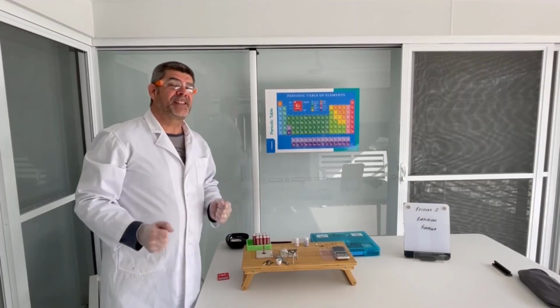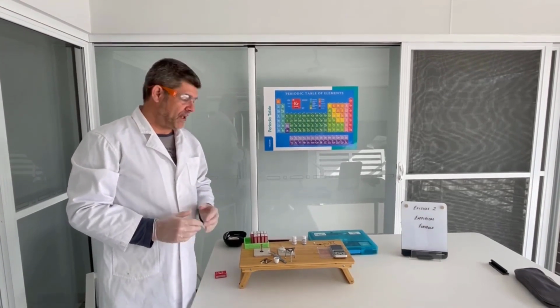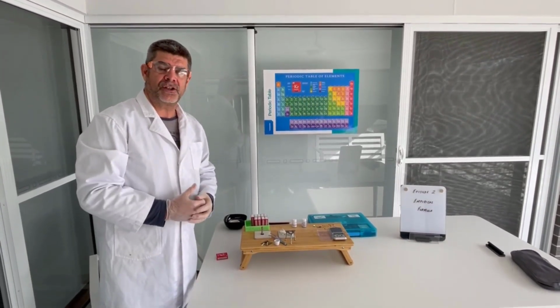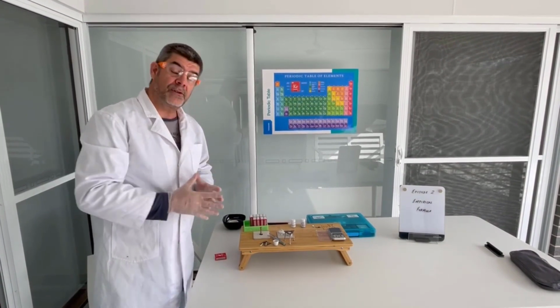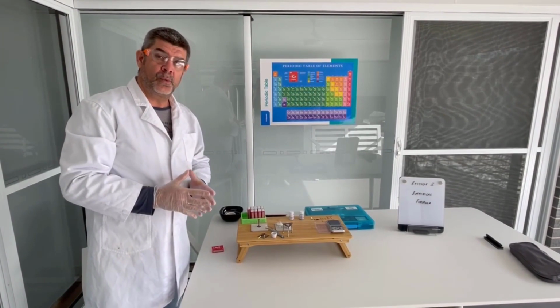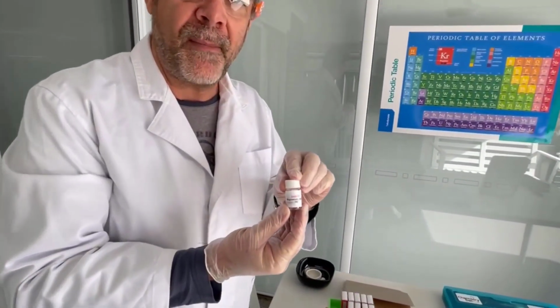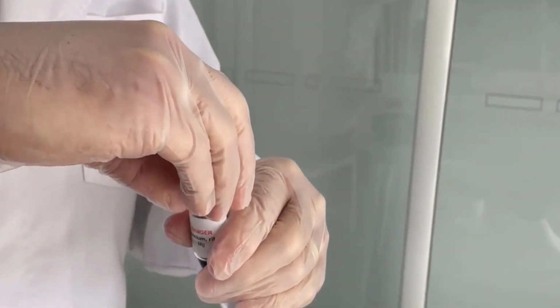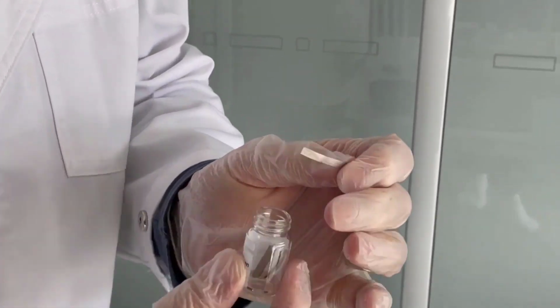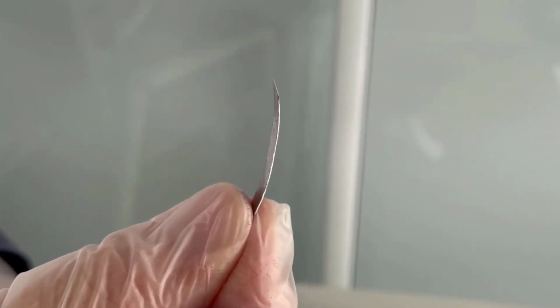So burning magnesium is such a lot of fun, but what we want to try and do is see if we can quantify this in some way. That is, to work out exactly how much oxygen is combining with the magnesium in order to form that magnesium oxide product. To do that, we need to weigh the magnesium beforehand. So I'm going to grab a little piece of my magnesium ribbon. I can't use the one that I've already used, so I'm going to use a new, nice, clean piece. So here is my magnesium.